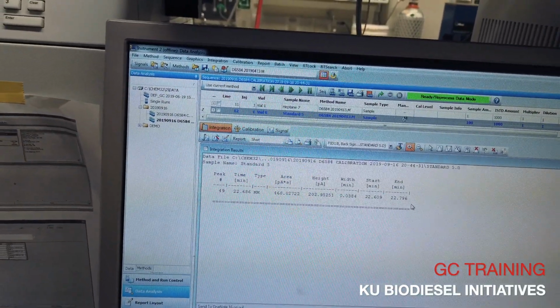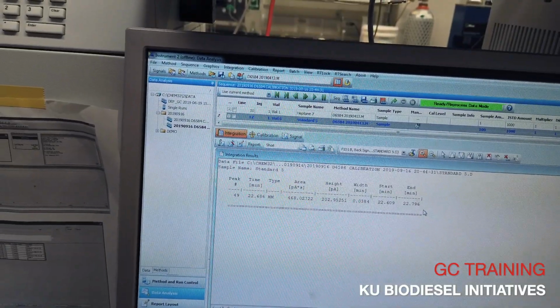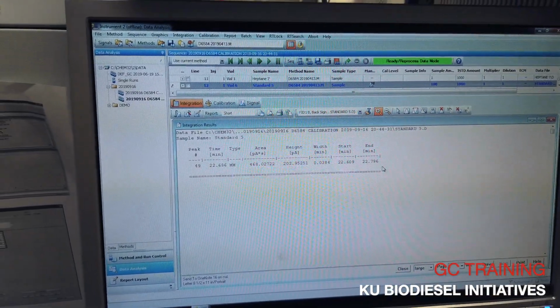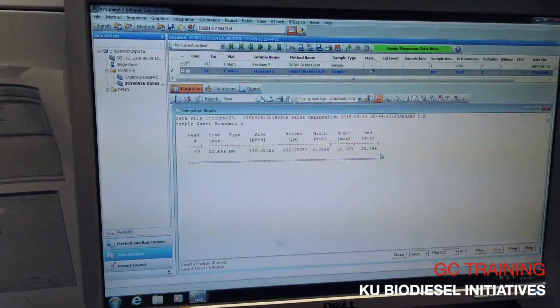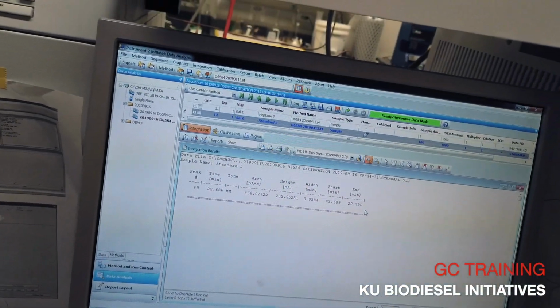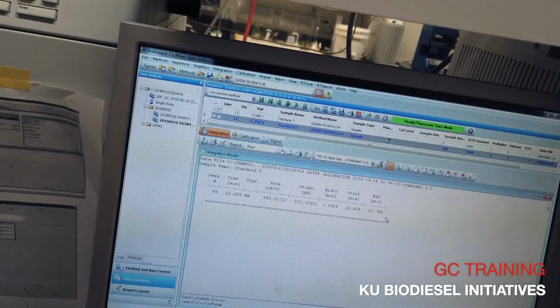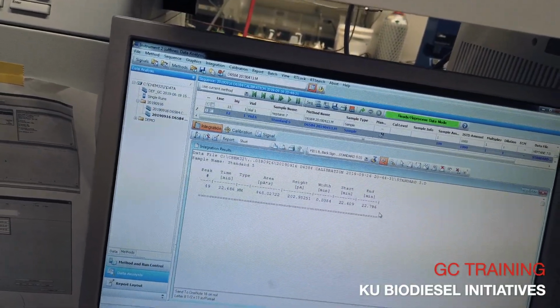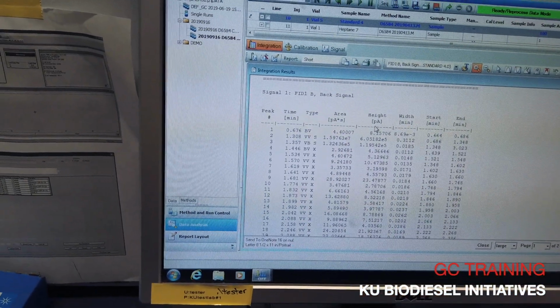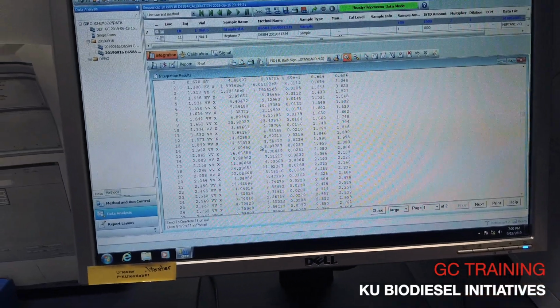And then of course the last one's on a separate page because Agilent hates us. I wish there was a way that this could be projected onto a bigger screen, and then we could all just be sitting instead of me sitting here and you all standing. The amperage times seconds. So, because it's basically like the height times that.